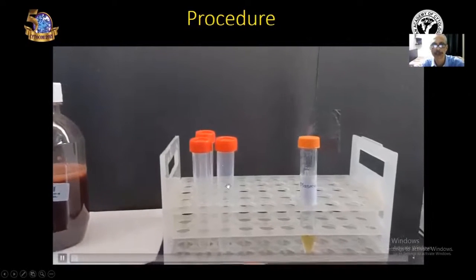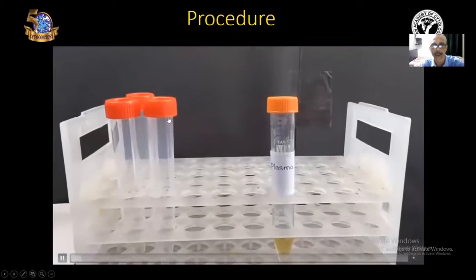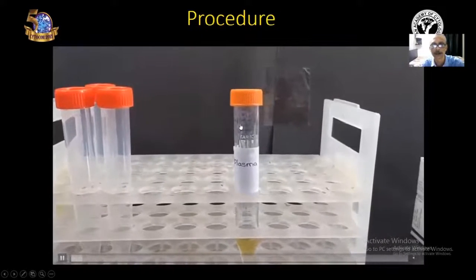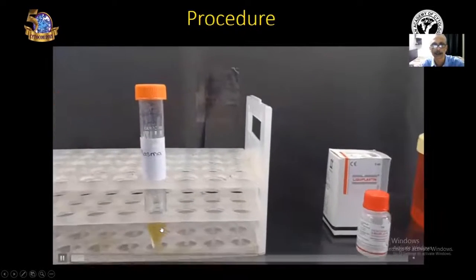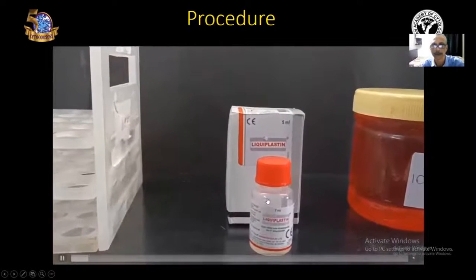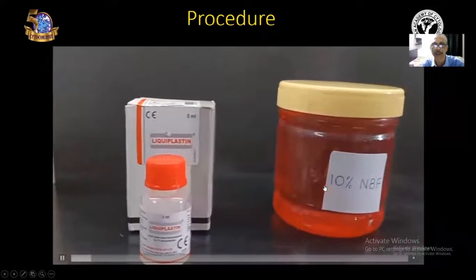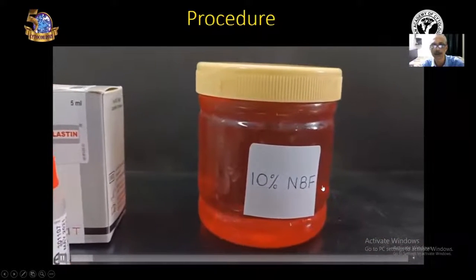Plastic centrifuge tubes of 15 ml capacity with screw caps, plasma taken in a test tube, thromboplastin, fixative for the cell block which is 10% neutral buffered formaldehyde.